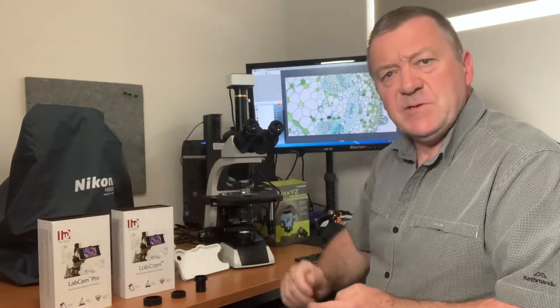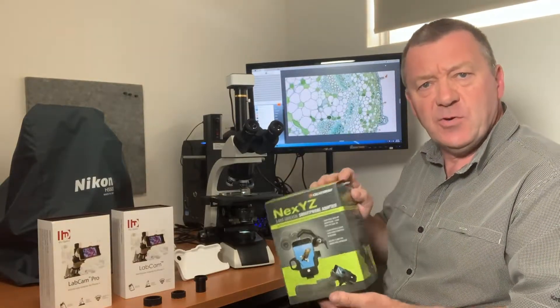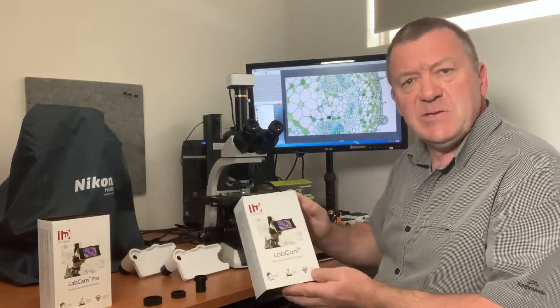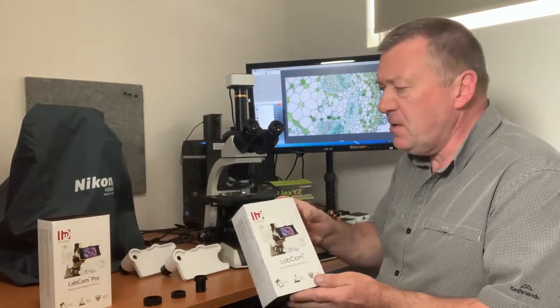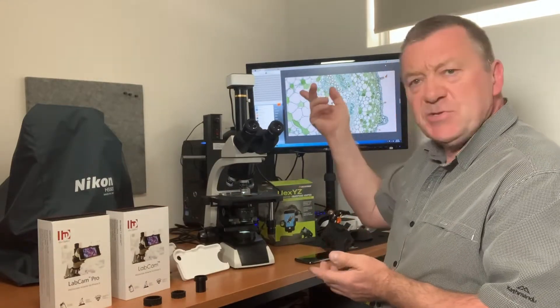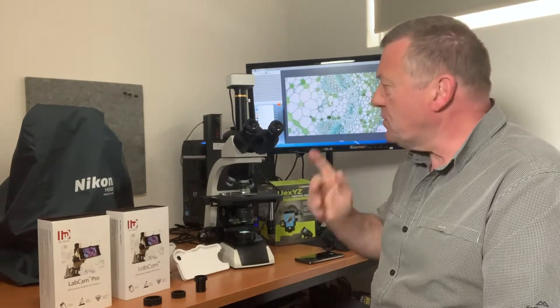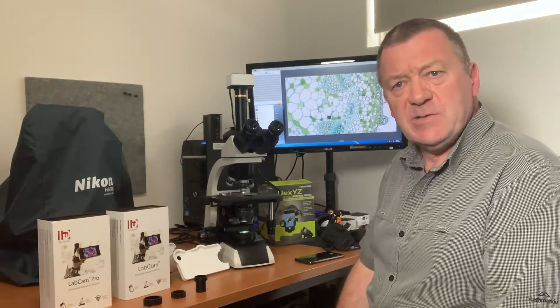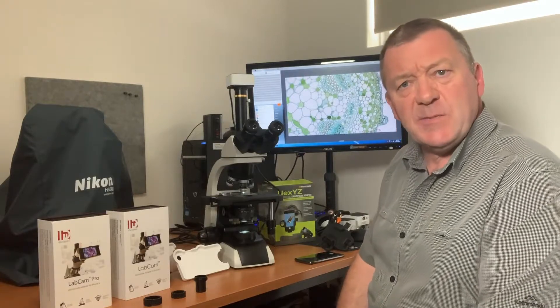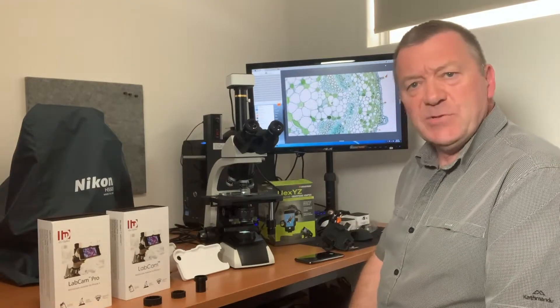There's quite a difference in price range. I picked up the Celestron off eBay for a hundred dollars. The LabCam original retails around $400 Australian and the Pro around $500 Australian. The dedicated camera I chose for comparison is also around the $400 Australian price range — this is one of our budget range of cameras.